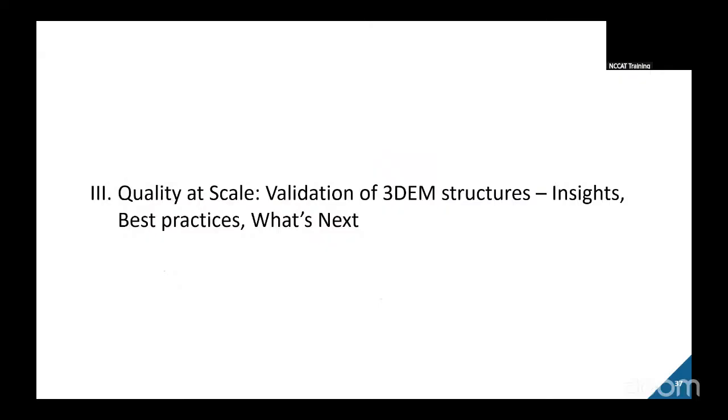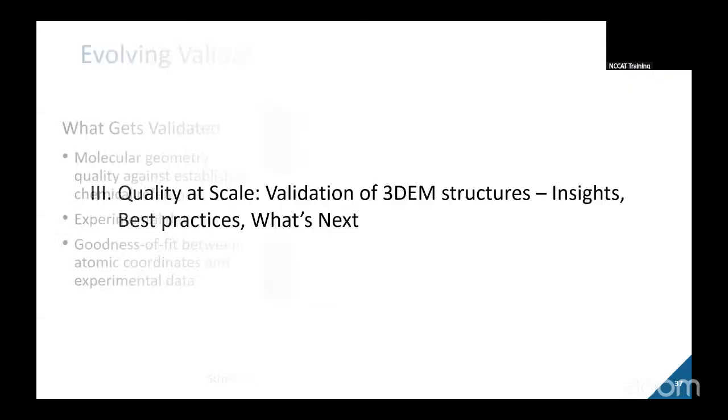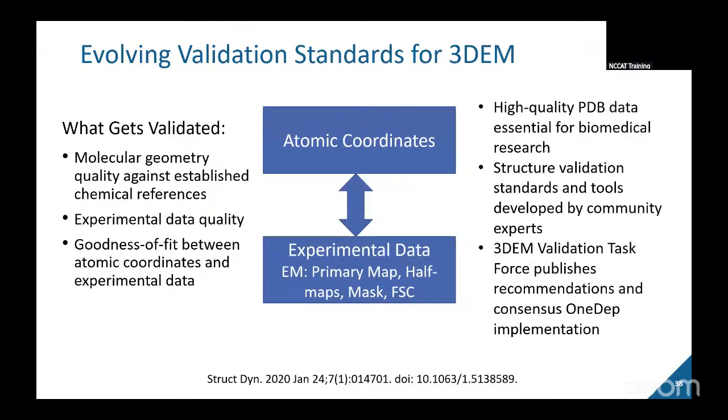We are the structure police, and so I'll say that now as we talk about the topic of validation. For the final part of the talk, the key is to just remember that validation is not fixed. It's constantly evolving. The standards are continually being refined, and the worldwide PDB relies on community input to guide what gets implemented in OneDep. So we encourage everyone: stay up to date, follow the key publications, join in ongoing discussions.